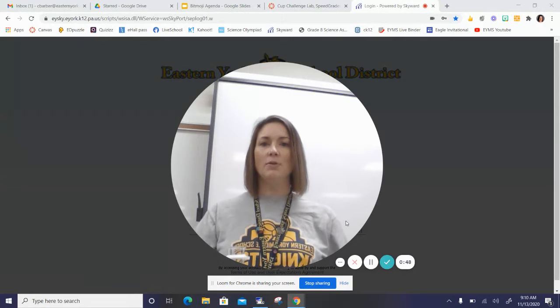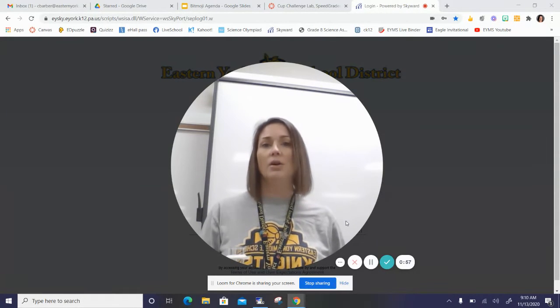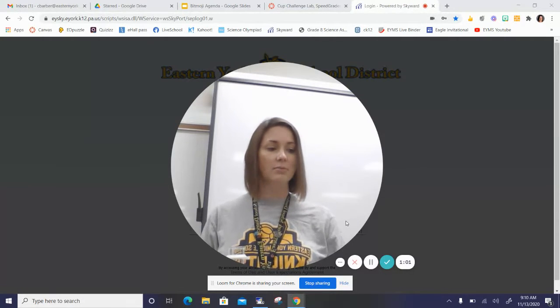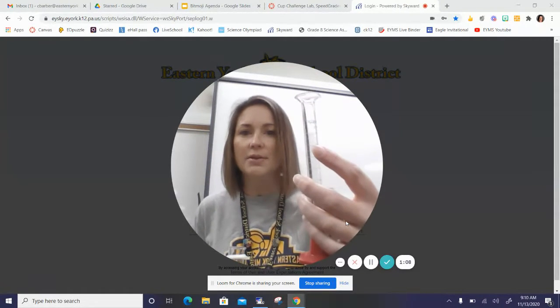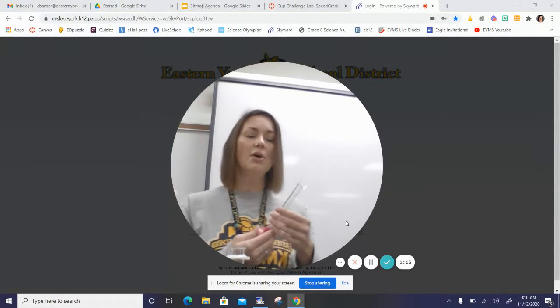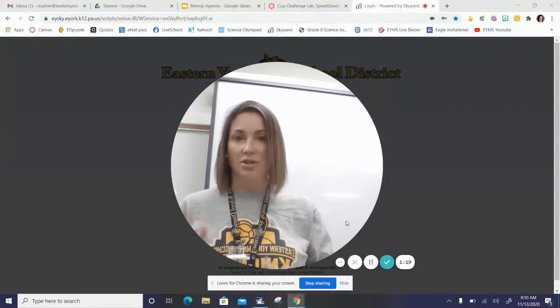And so each time you measure, and the same is true for the worksheets online that you're completing, you have to figure out the scale or what you are counting by, the value of each of the little tiny subgraduates, which again are all those little lines on the cylinder that are not numbered. And again, that's for space reasons. They would never be able to fit all those measurements on there. So each time you measure, you have to figure out the scale before you actually use it.